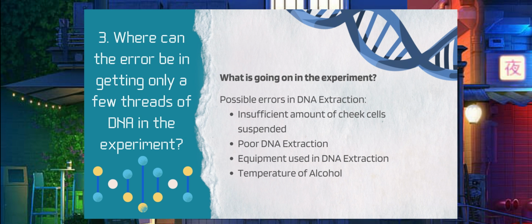It is said that the more cheek cells gather in the salt water, the more strongly we gargle. And then our cheek cell membranes will be broken down upon the addition of the washing liquid. So our DNA gets discharged in the salt water because of it. Well, we all know that DNA is insoluble in alcohol. It solidifies when the alcohol and salt water collide.